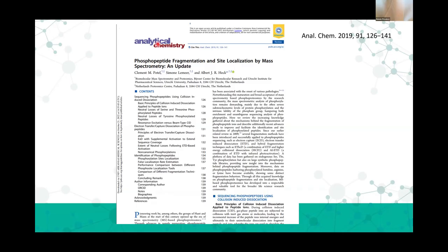This is just showing a paper. And again, it's a couple of years old, but it's a pretty good place to start if you're interested in looking at phosphopeptide literature. This is a good jumping off point for that.